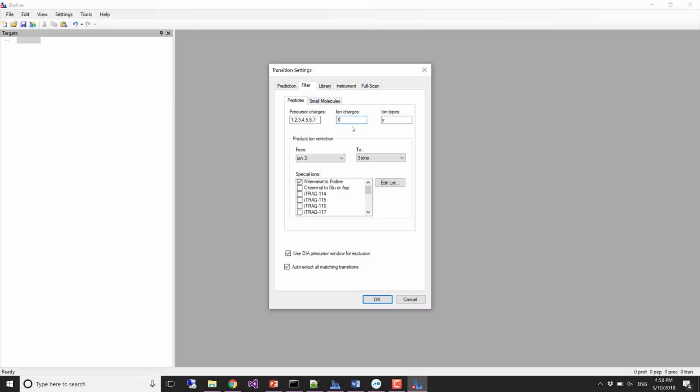And then you also see fragment ions in this data set that go up to charge 6, and that's why it is pretty useful to have a low m/z cutoff, because a charge 6 fragment ion, the small ones, could definitely be down around the tens of m/z.